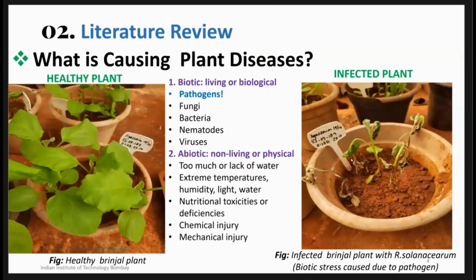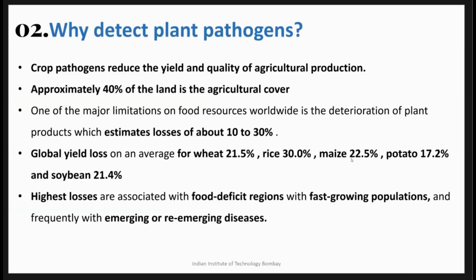As we know, plant diseases can be caused by various factors. There are biotic as well as abiotic factors. What we are looking at is a pathogen, so it's a biotic factor which we would specifically detect. A very important component of a biosensing platform for this type of application would be the recognition element, like DNA or antibodies, which would specifically bind to the target.